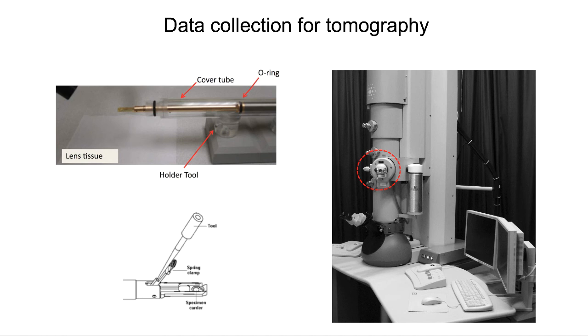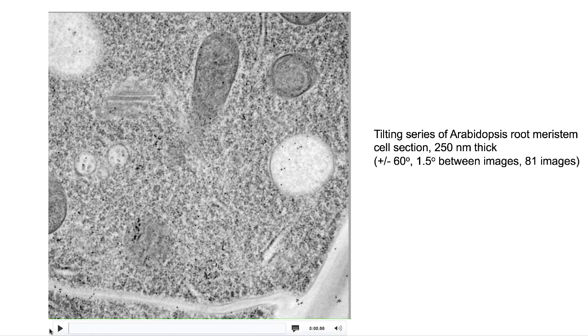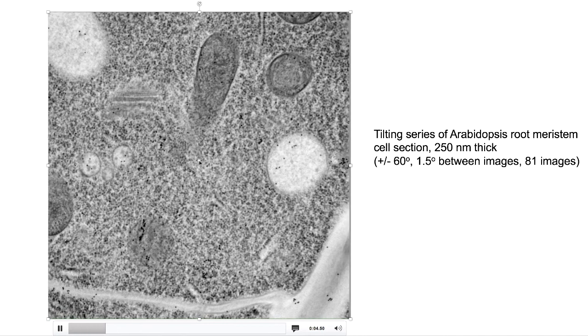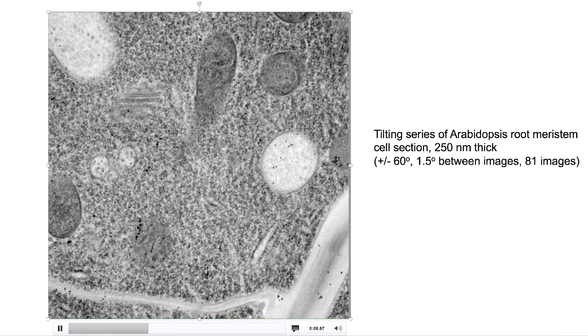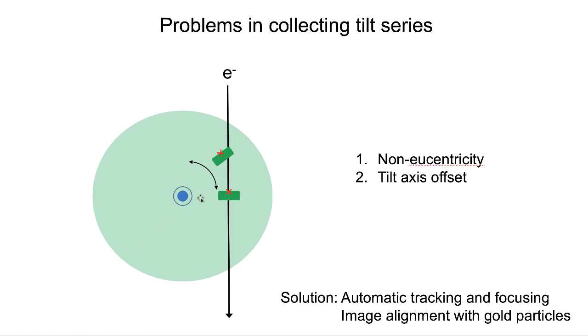It should also have a very accurate XY position controller. The reason is that the EM section is not always located at the center of the rotating axis. This image is shown as if the center of rotation is at the mid position of the images, but in most cases this is not true, because the section is located off the rotation axis, and as it moves, its height changes and its XY position changes.